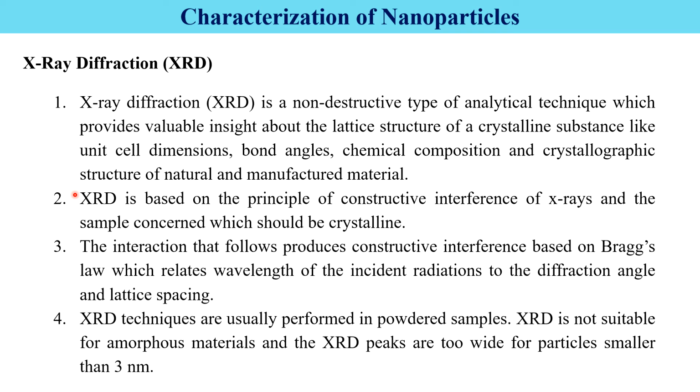XRD is based on the principle of constructive interference of X-rays and the sample concerned, which should be crystalline. The interaction that follows produces constructive interference based on Bragg's law, which relates the wavelength of incident radiation to the diffraction angle and lattice spacing.